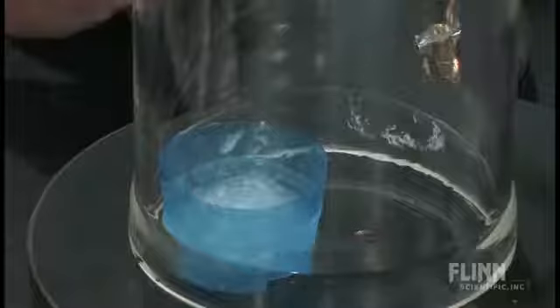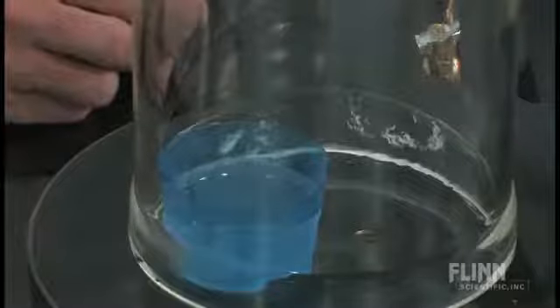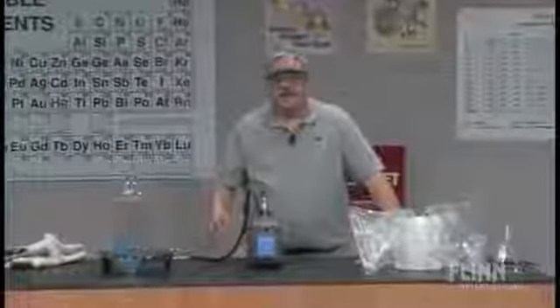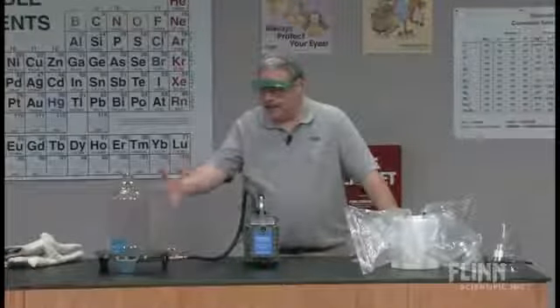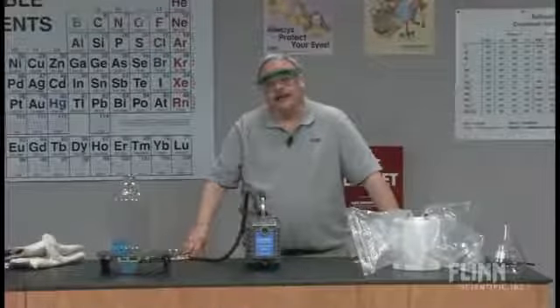And now what I want to do is see if we can get it to stay. I want to slowly let the air back in there. And I'm going to cut the vacuum pump off. Jeff, cut the vacuum pump off, please. And you can see it go back to melting very, very slowly. So, a phenomenal demonstration to show, even though nitrogen typically exists as a gas in its normal conditions, it can exist as a liquid in a Dewar flask or, as we saw here, in a solid state.